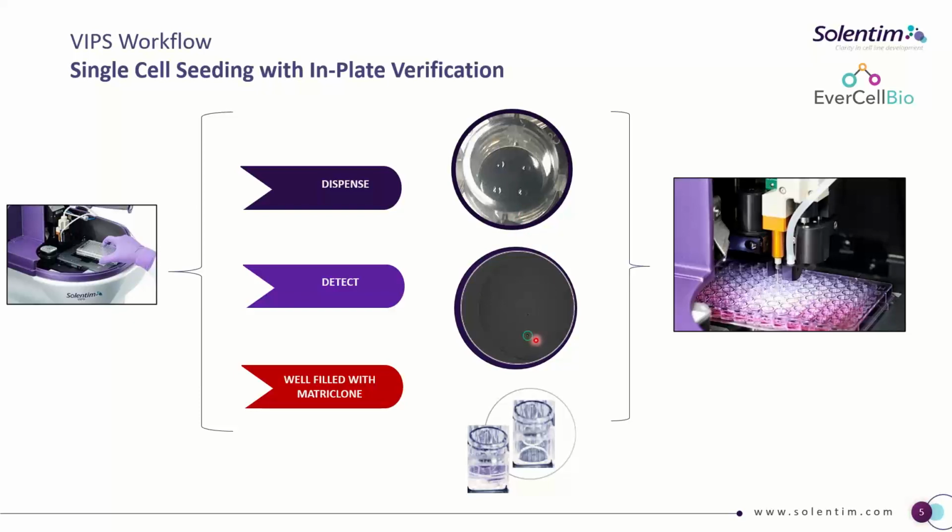And then importantly, we process a single well at a time. So as soon as we've identified the cell, and it's identified here, we fill it up from a separate nozzle with matrix and media, and that's where our MatriClone growth media will be coming from.